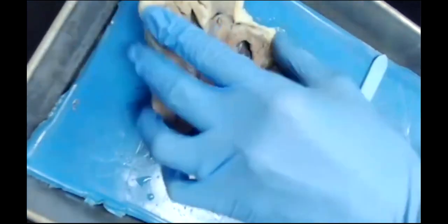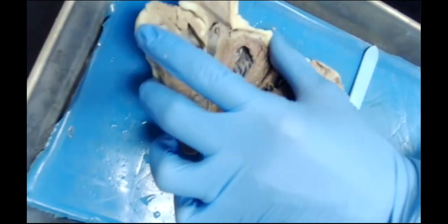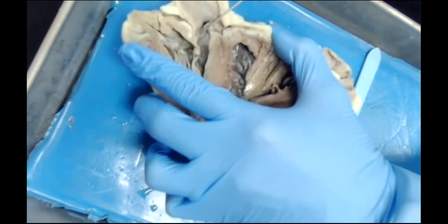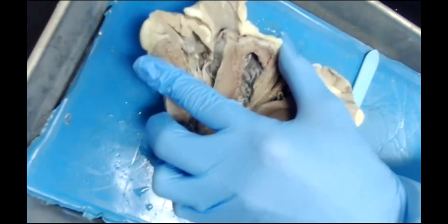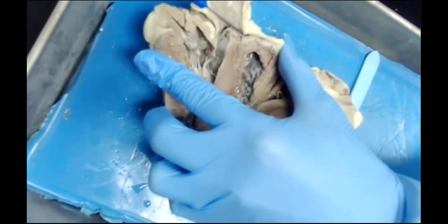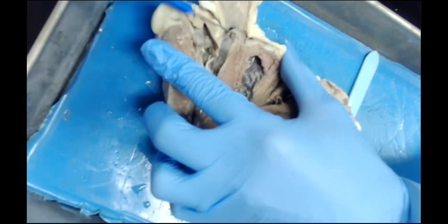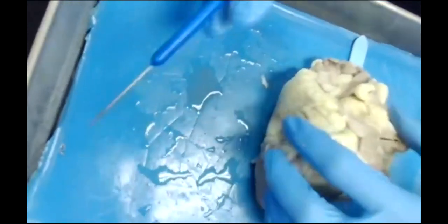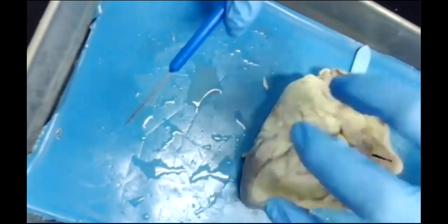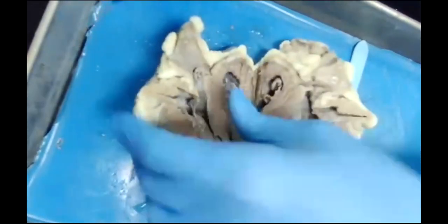You can also get a nice view right here of our coronary artery, or one of our coronary arteries. So you can see a little divot kind of right here. It's not wanting to focus for some reason, but there's another one right here. So if this is our aorta, we can see this little branch. There's one on the right, one on the left, at which point this is basically where blood is going to leave the ascending aorta and immediately get routed down to the blood vessels of the heart so that we can actually get all of these heart muscle cells all of the nutrients and stuff that they need.